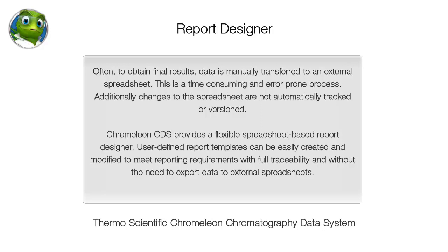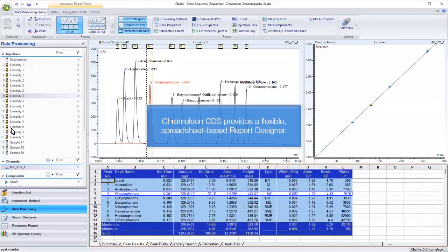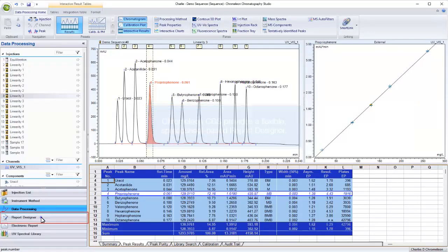Chromeleon CDS provides a flexible spreadsheet-based report designer. User-defined report templates can be easily created and modified to meet reporting requirements with full traceability and without the need to export data to external spreadsheets.